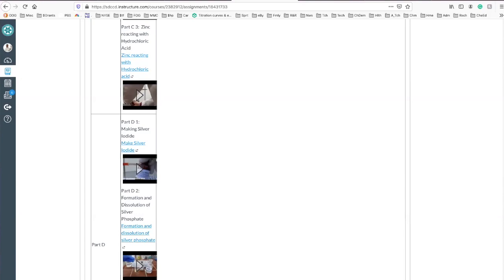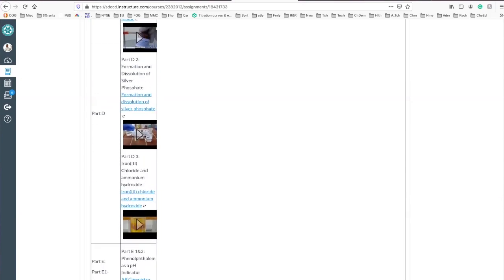Chloride and ammonium hydroxide. Part E, the last one. There's actually two parts in this one video. It's the titration reaction of nitric acid, HNO3, plus sodium hydroxide, and sulfuric acid with sodium hydroxide. And notice the comments here. It took 19 drops for the first part, and for part 2, it took 42 drops.